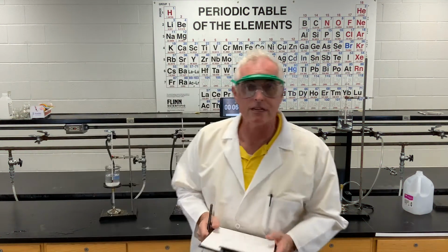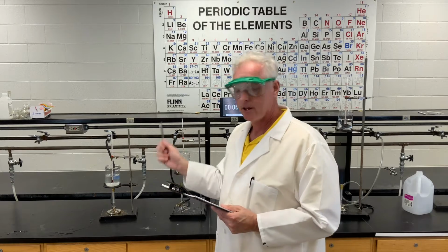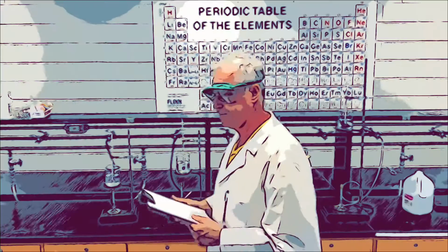Okay, 6 minutes and 10 seconds in, and height number 1 has also reached our target temperature of 90 degrees. We're going to shut it down.